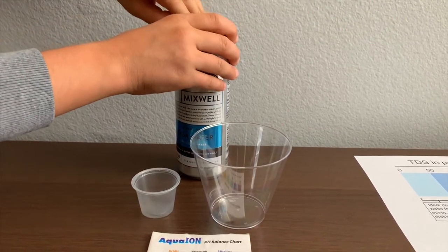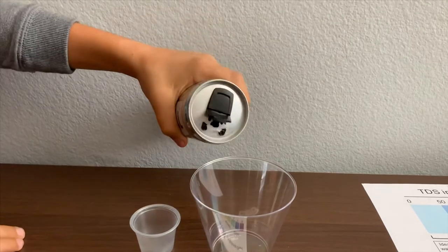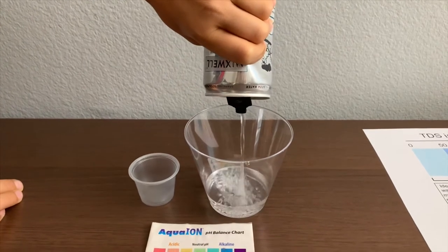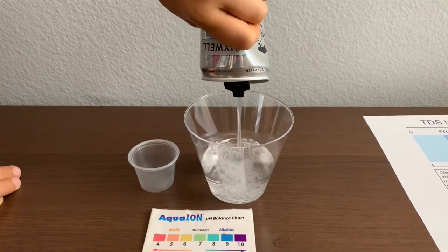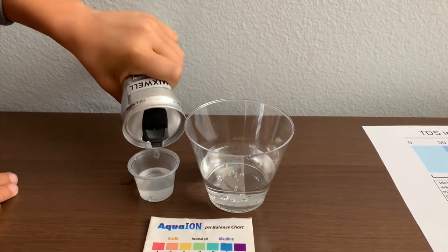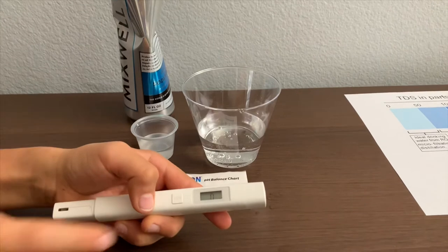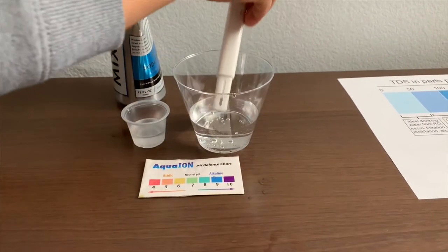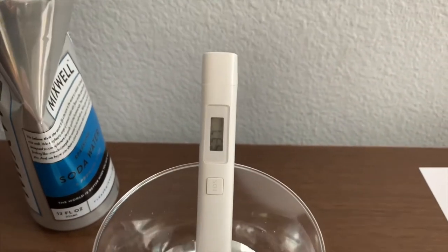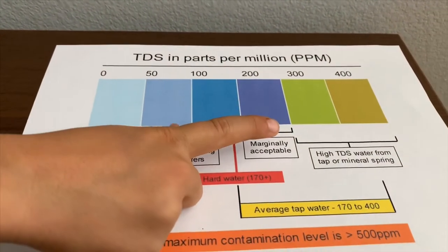Let's test the pH and TDS levels. Let's pour some water in and test the TDS levels first. Turn on the TDS tester, make sure it says zero, and put it in. It is in the 500s — that indicates its high mineral content.